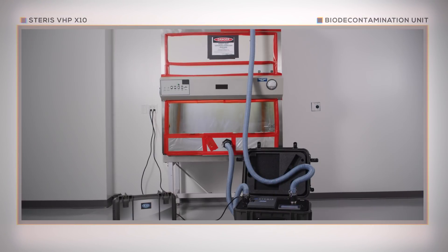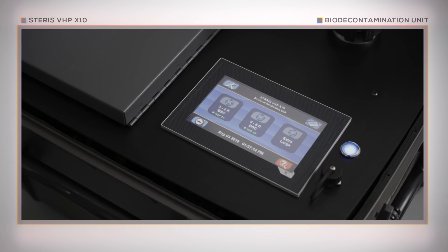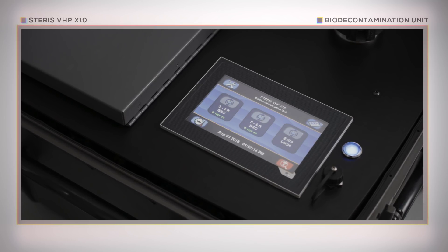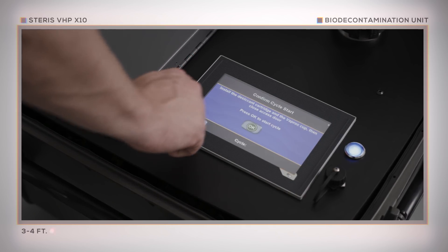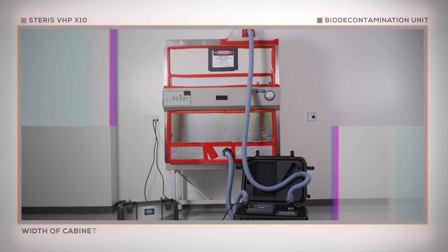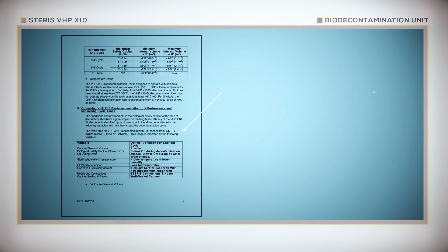Once your safety cabinet is taped and connected to the X10 unit, you are ready to begin the cycle. The X10 control screen will guide you through the cycle selection and startup procedure. The X10 unit includes three factory-programmed cycles for different-sized biological safety cabinets. Select from 3 to 4 feet, 5 to 6 feet, or extra-large cycles. The width of the cabinet will determine cycle selection. The Steris VHP X10 application guide can provide further cycle selection details if needed.